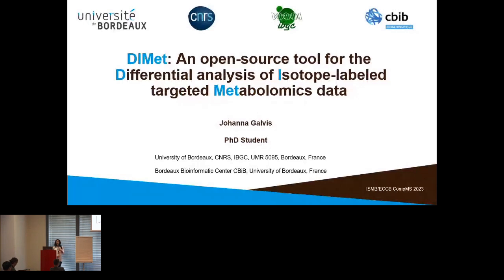And now I am thinking that there is one other point that is missing here, that is multi-platform, because most of the mass spectrometry world relies on Windows, but new software is available on many other systems, Linux or Mac OS. I have listed these best practice expectations for the tool that we need for the differential analysis of labeled metabolomics. And there have been big efforts in this direction.